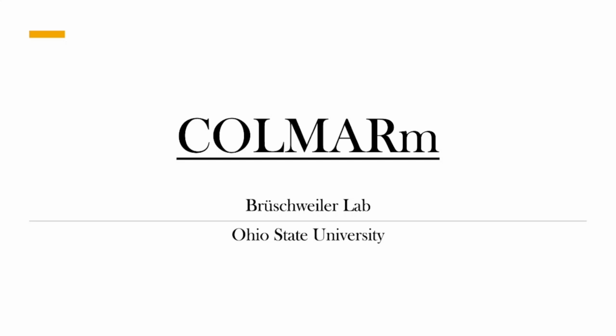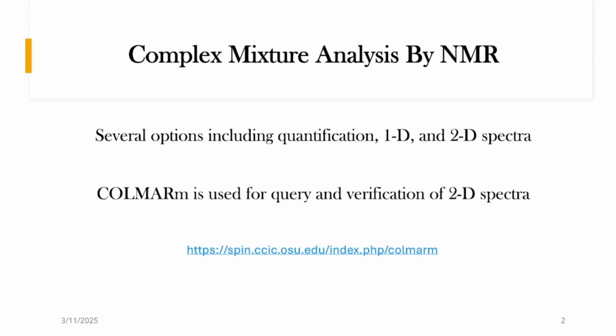I'm going to demonstrate how to use COLMARm, the two-dimensional NMR software. COLMAR was created by the Bruschweiler Lab at The Ohio State University. COLMAR stands for Complex Mixture Analysis by NMR.